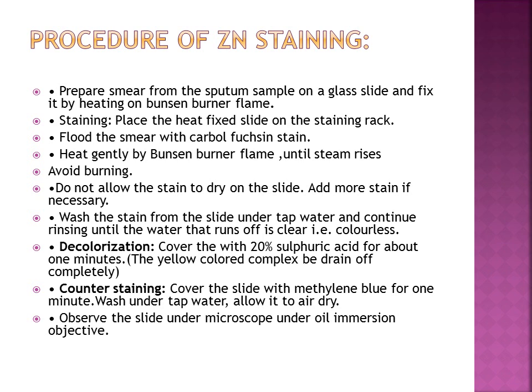Then the second step is decolorization, which is done with 20 to 25% sulfuric acid for 1 minute. Then the next step is counter staining. Cover the smear with methylene blue for 1 minute, then wash, dry, and then put oil and see under the oil immersion lens of the microscope.